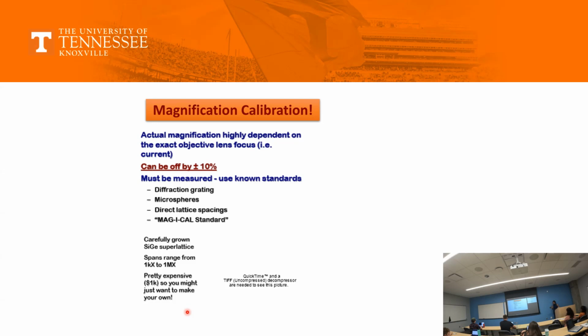They will totally decalibrate the system. Everyone does it. And once you do it, you have to immediately press the emergency button to stop it, especially if you crack the vacuum. The biggest training in microscopy is to put the sample holder in correctly, because that's where you are cracking the vacuum by inserting something.